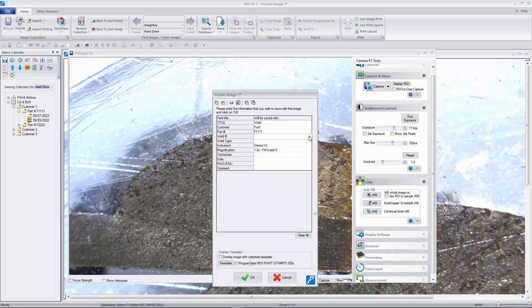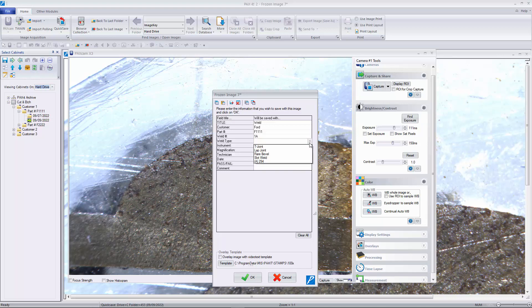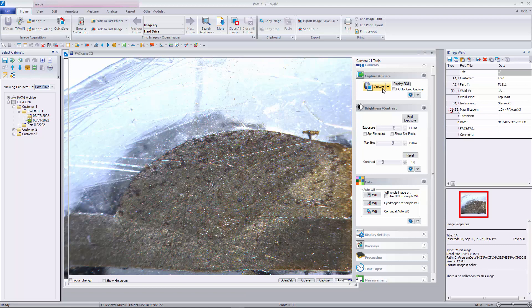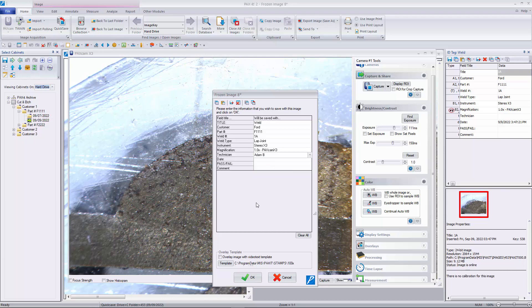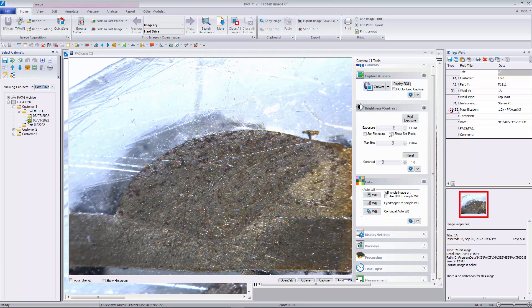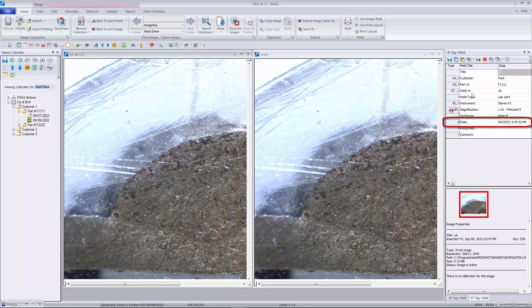Fields are easy to tab through and can also be configured as dropdown menus to further simplify and quicken data entry. One simply fills in the other applicable fields, clicks OK, and on the next image capture the additional data remains filled in. Users are left to fill in only the fields that vary from image to image, which is often reduced to just a few. Certain fields, such as inspection date, may be set to populate automatically in the Paxit preferences.